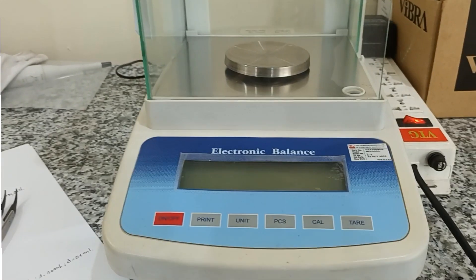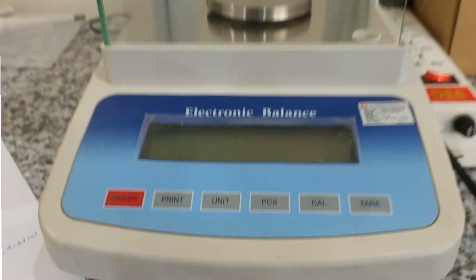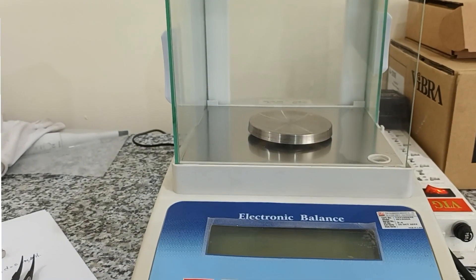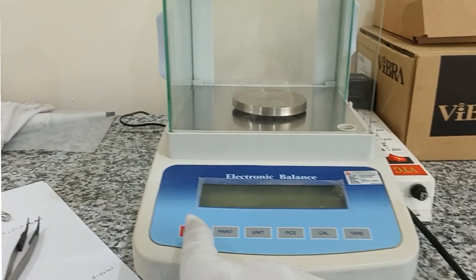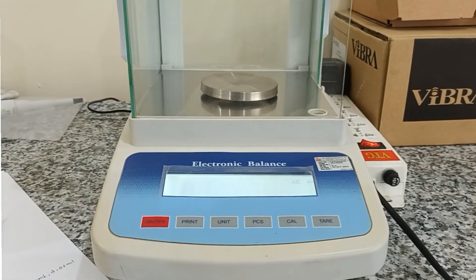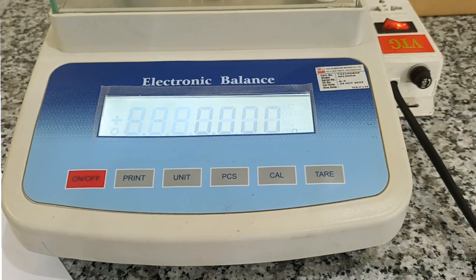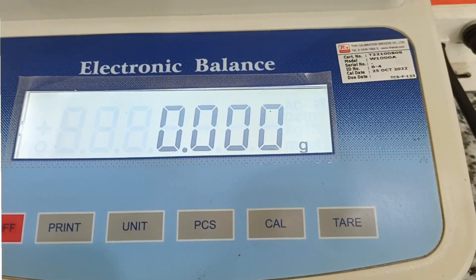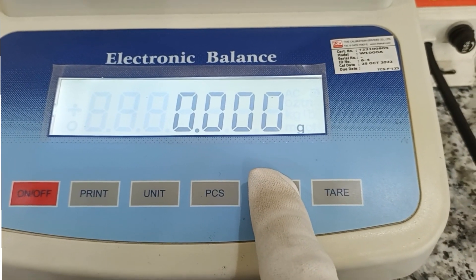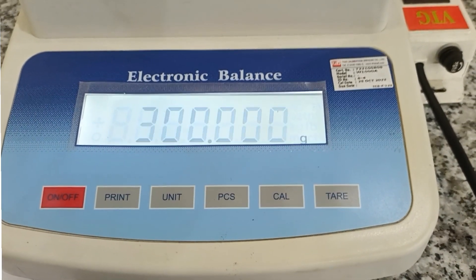Hello everybody. I will do an adjustment for an electronic balance. First, I will check this model. I turn on this balance and press the key to show the calibration color.